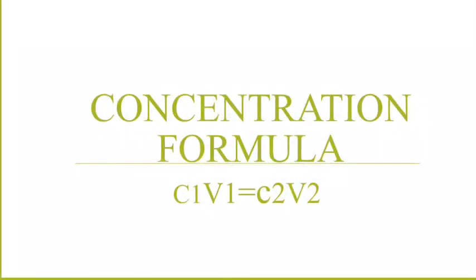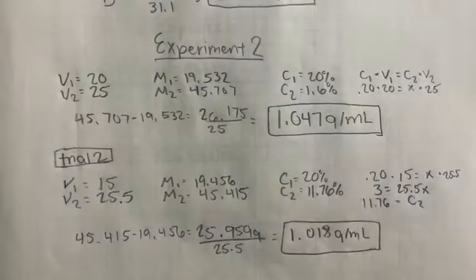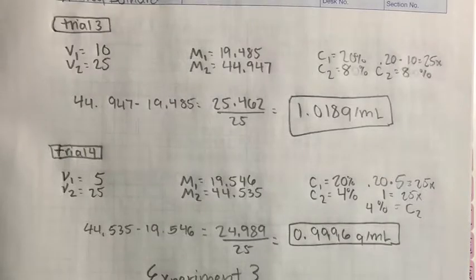Using this information, we used the concentration formula to find the concentration of the stock solution in the flask. Using the formula C1V1 equals C2V2, we were able to find the concentration of sugar in each solution, where C1 represents the concentration of stock solution, V1 represents the volume of stock solution, C2 is the new concentration after dilution, and V2 is the new volume.